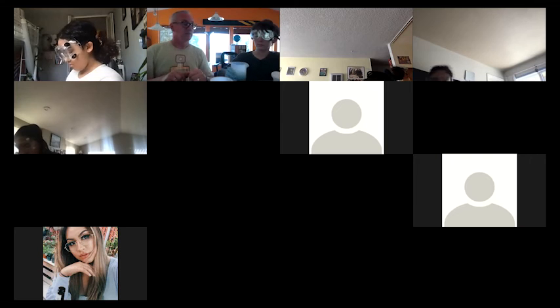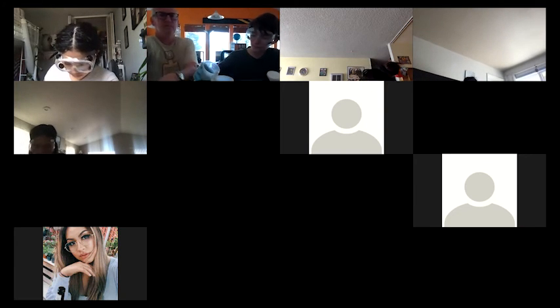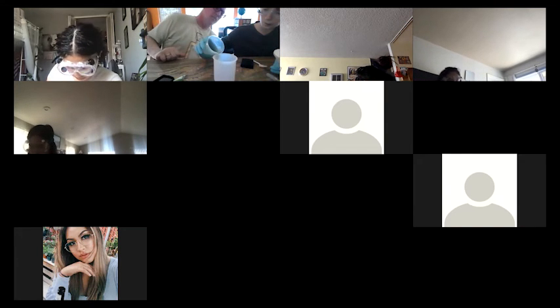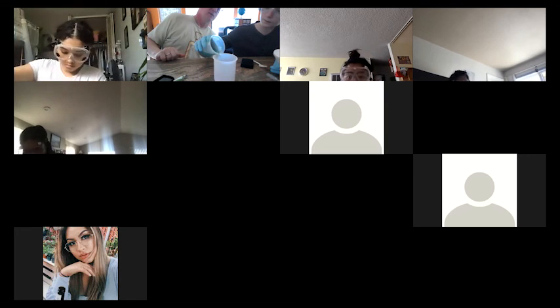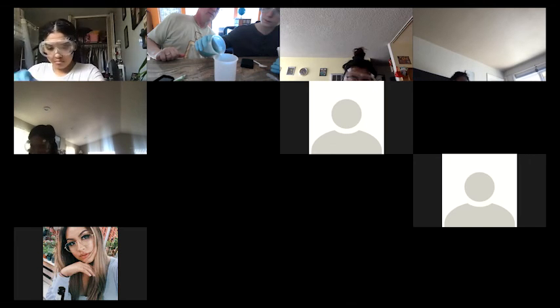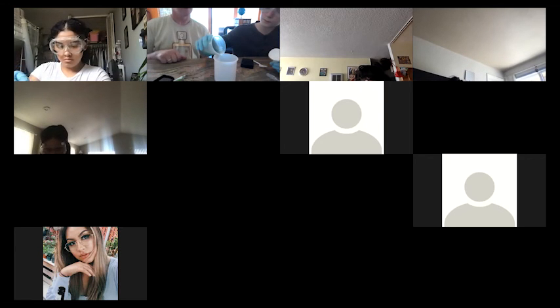And so what you want to do now is to slowly pour the liquid from this into here. Try not to get any of the solid out, just really slowly. There you go. If you lose a little bit, that's fine. There you go. Perfect. No rush to this part.